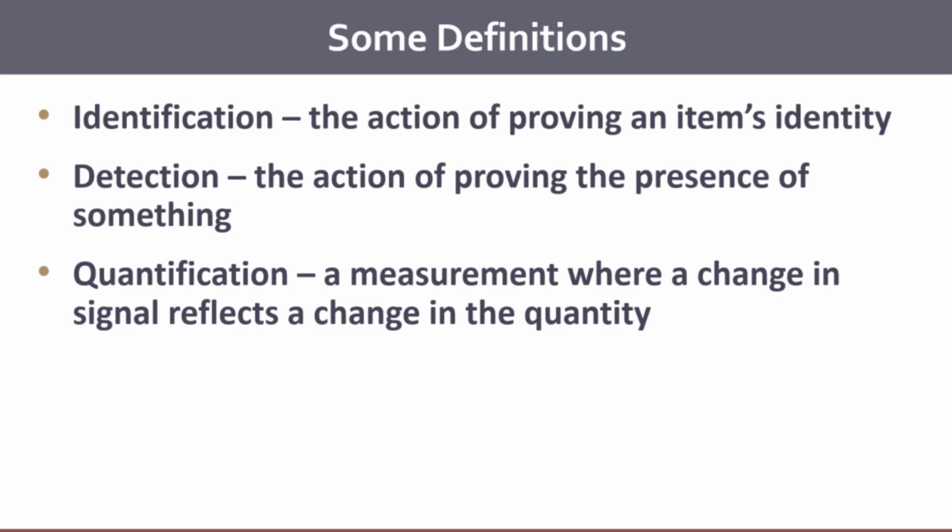So a lot of people say they ID something, and a lot of this is a carried-over term from the old idea of collecting data dependent acquisition and determining the identity of those individual spectra. Our lab tries to use quite frequently the word detection, because what we're more interested in is, for things that we know are in the sample, can we detect them? Are they detectable? We're not trying to define something new that hasn't been discovered before. We're trying to determine whether or not that thing is detectable in that sample.